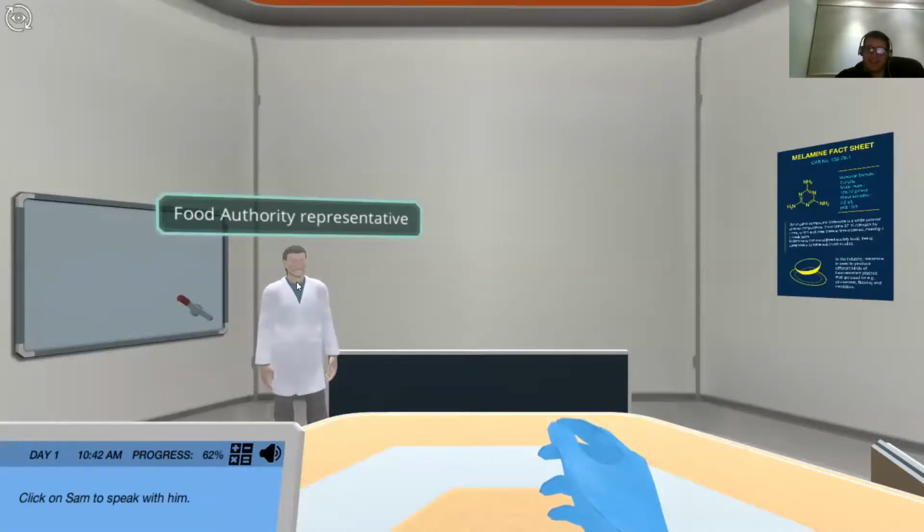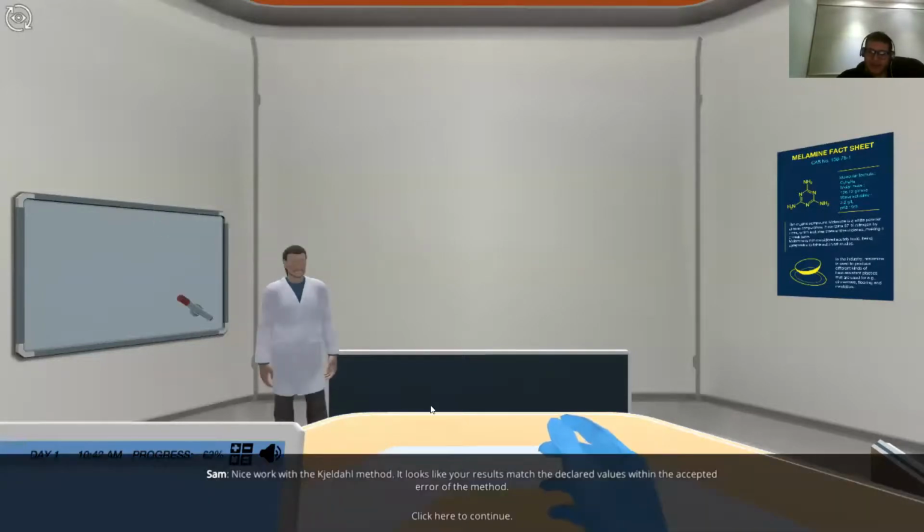Sam. Click on Sam to speak with him. Nice work with the Kjeldahl method. It looks like your results match the declared values within the accepted error of the method. We just got a tip that one of the batches might have been cut with melamine. We need to clarify this immediately before the product is shipped.